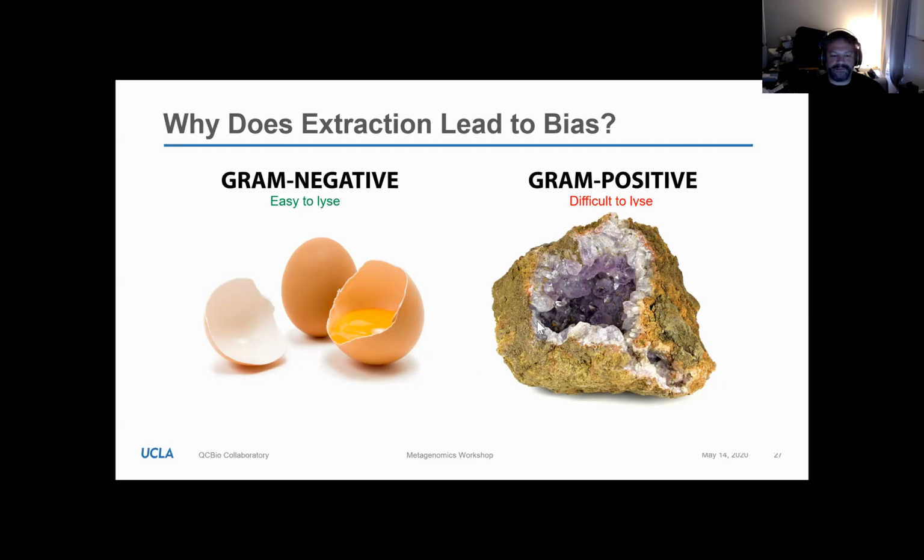But if I did a microbiome analysis on it, I would actually think it was about 95% E. coli and maybe 5% Listeria, because if the cells don't lyse, then the DNA stays in the cell when you wash out all the cellular debris. And that's a very fundamental point with microbiome: you don't see what you don't actually lyse.